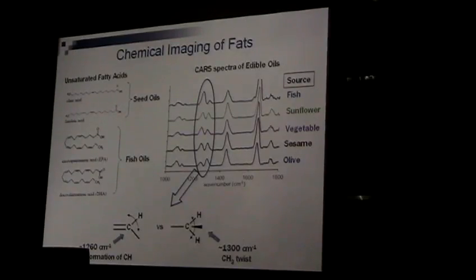Now the problem is we still don't know how this good fat can reduce cholesterol level in your heart at the cell level. One problem is we have no idea how to differentiate all these different fats at the cell level. You can do this by mass spec or NMR, but you have to extract it.